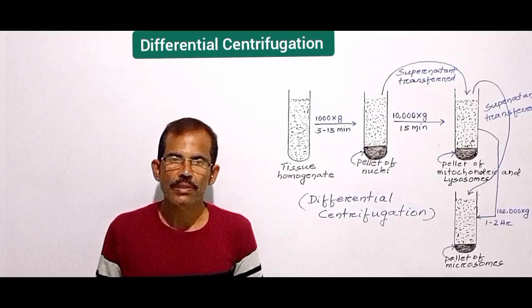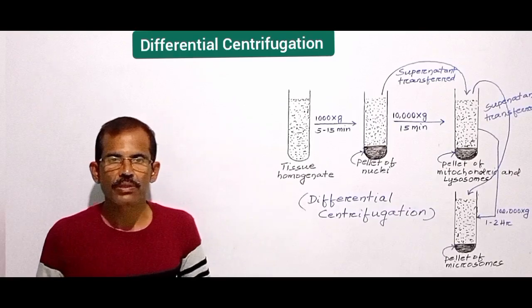Today we will discuss differential centrifugation.